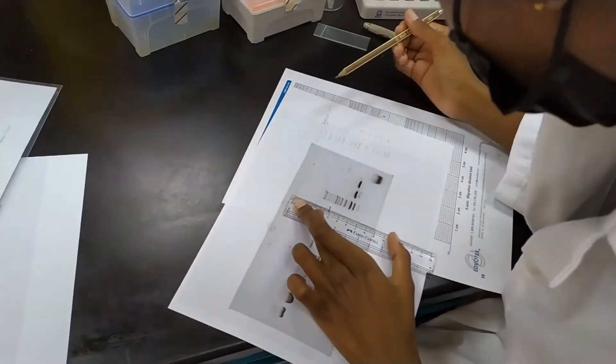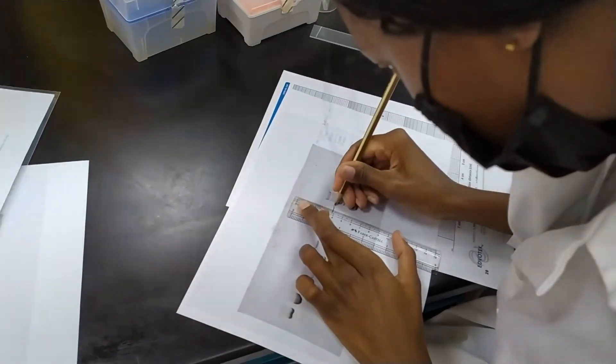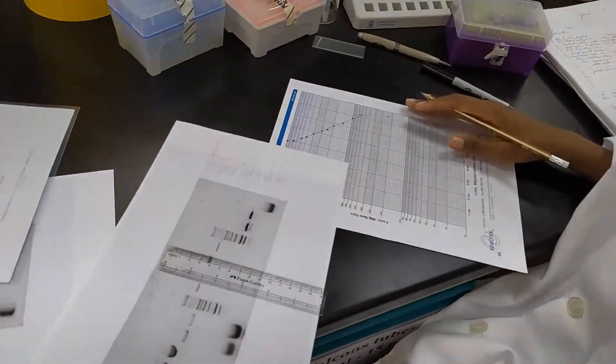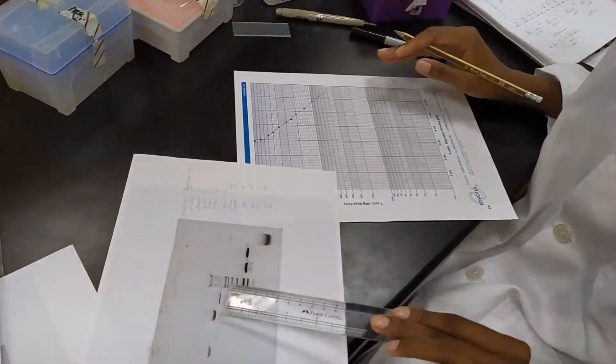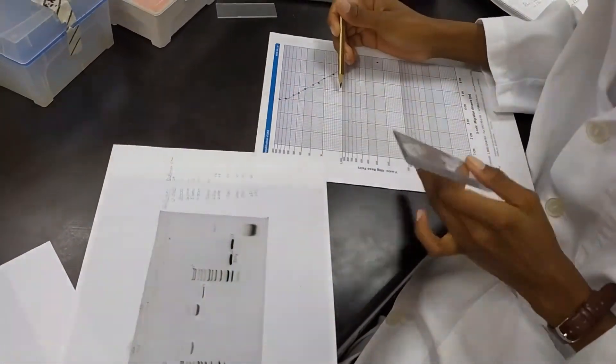In this case, Okonya is measuring the distance migrated by one of the fragments on her gel. She's then going to go to the graph and take that migration distance. And, based on the migration distance, going to go up to the line and then across to find out the size of the fragment.